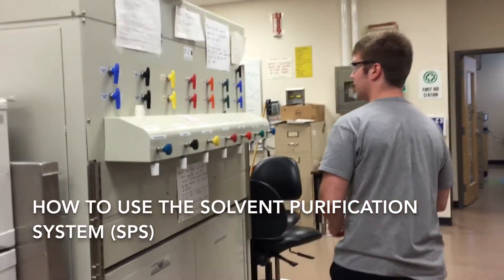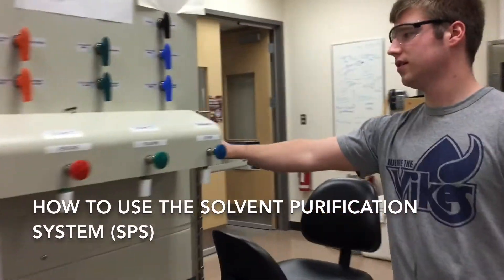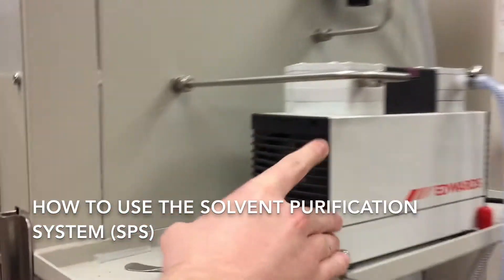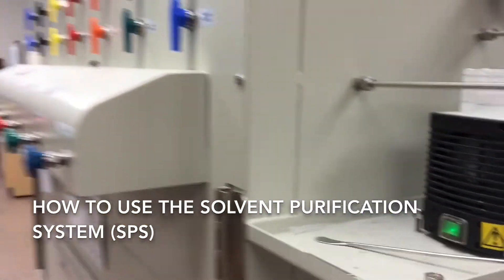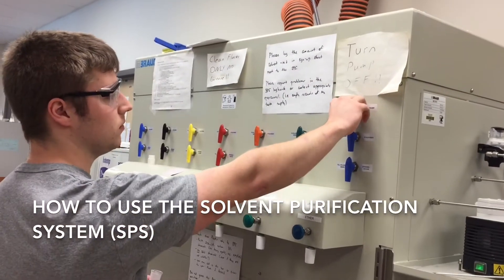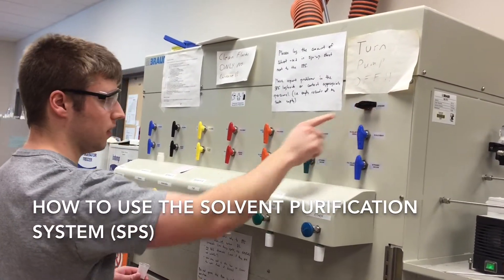You want to begin by moving over to the right side and turning on the vacuum pump. That's the first step, and then you want to turn on the vacuum — this black nozzle here to your left.